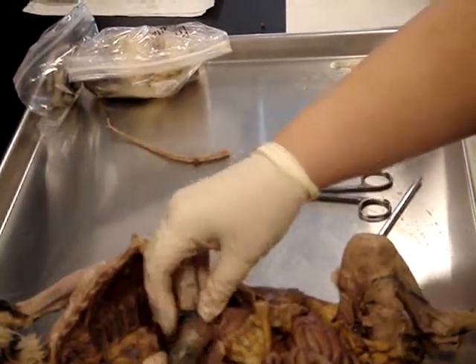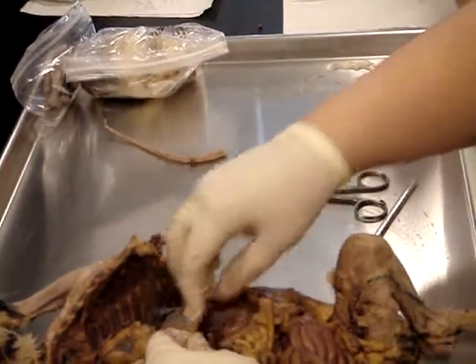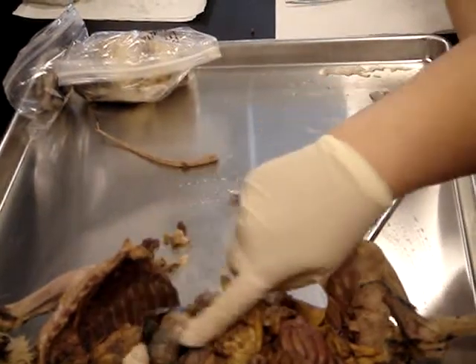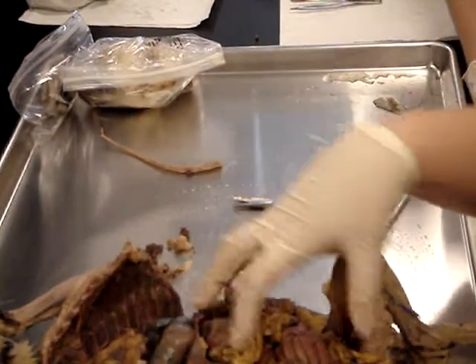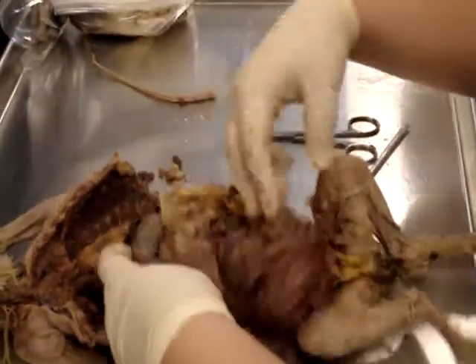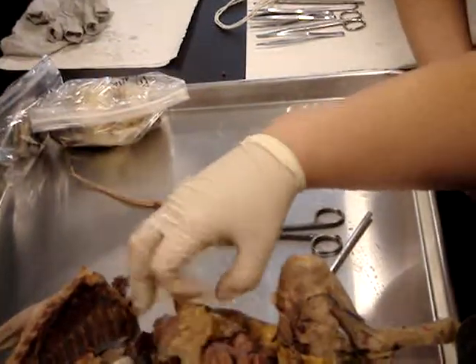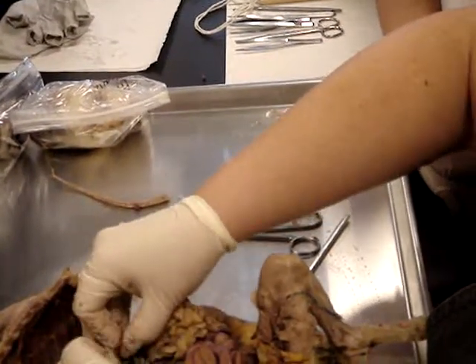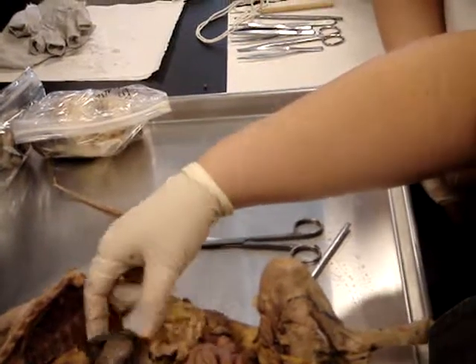And half of his liver is above his diaphragm. So he had a giant hole in his diaphragm, this cat. And so half of his liver poked up into his thoracic cavity. It's so big down here that half of his liver is up through his diaphragm and half of his omentum is up through his diaphragm, and it shouldn't be. So all of this blue up here, that should all be down there.